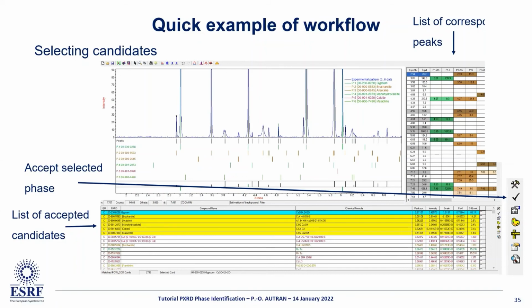And also it can be that sometimes if two peaks are very close to each other, it can use the wrong one and trick you into thinking it identified the two when it just got one. Or also sometimes having single crystals. If you have a single crystal that gives you just one peak because the orientation was not good, then you can have issues. But it depends. It's really related to the type of samples you want to analyze. And also having very minor, extremely minor phases is a bit more challenging. You need to look very much in detail.